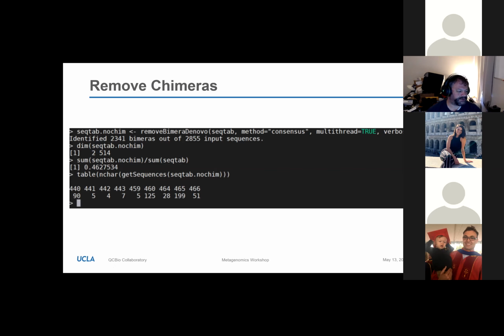So essentially what it's doing when it's doing the find errors, it's using something like expectation maximization. It's running a bunch of iterations on the sequences, and it's trying a bunch of different hypotheses. The first thing it's going to do is hypothesize that your entire sequencing experiment was done on a monoculture. With a monoculture, it's hypothesizing that there's only a single 16S sequence present, and that every sequence that doesn't match it is generated by error.